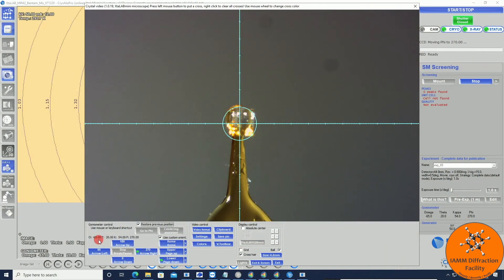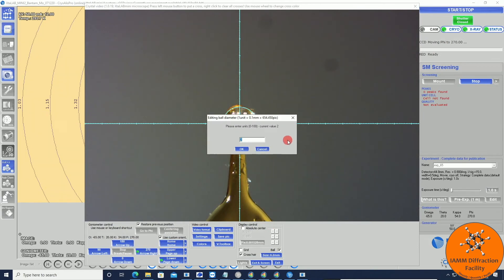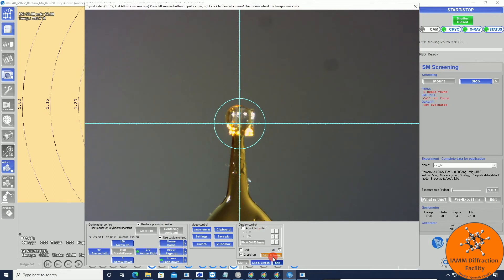I will point out that if you have a smaller or larger crystal, and you want this circle to be smaller or larger to help you center the crystal, you can come down here to the size button and enter some other number than two. These are in tenths of a millimeter, so if I enter three and click OK, that would make this circle bigger. It is now three tenths of a millimeter or 300 microns. Two worked pretty well for this crystal though.